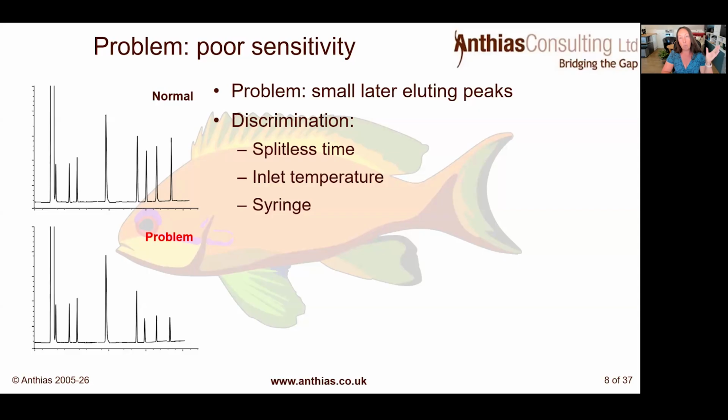What happens is, when we put our syringe into a hot inlet with a very volatile solvent and push down the plunger, the solvent doesn't squirt out the end of the syringe as we imagine, but evaporates from inside the syringe needle, because the needle has been inserted into a very hot inlet and heats up. Our volatile compounds also evaporate quite easily, but what do you usually do?